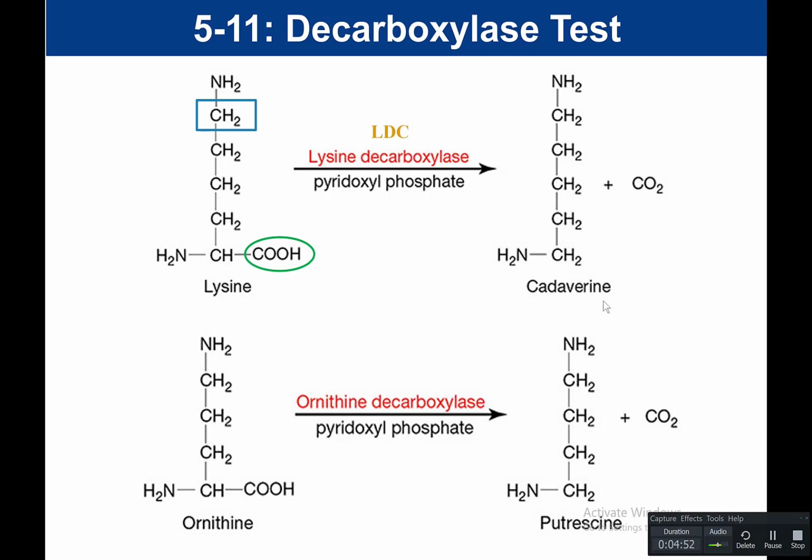And when they decarboxylate those proteins and remove the carboxyl group from the amino acids, in the case of lysine, it's going to produce cadaverine. The cadaverine is going to produce that really putrid, gross, rotting smell. And the carbon dioxide is what causes the body to bloat, right?